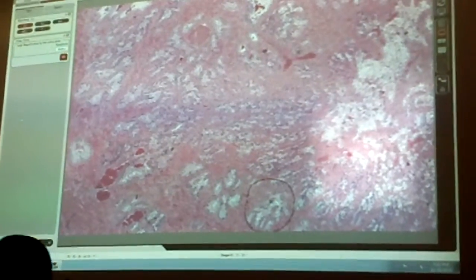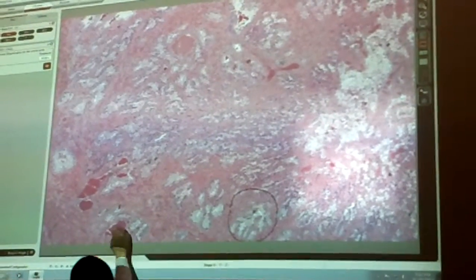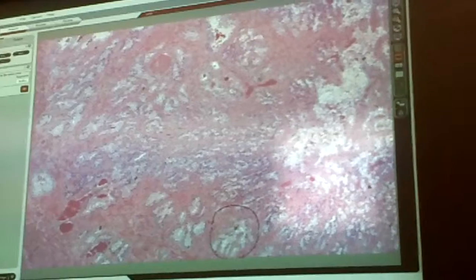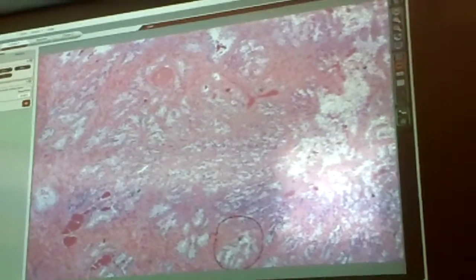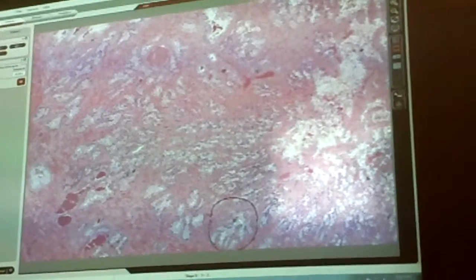All right, what is it? What organ is it? Resting mammary gland? Prostate. The prostate gland. Prostate. See what I'm saying? Secretions. You said it. That's the prostate. See, I'm not crazy. Sorry, I didn't get that. Concretions.